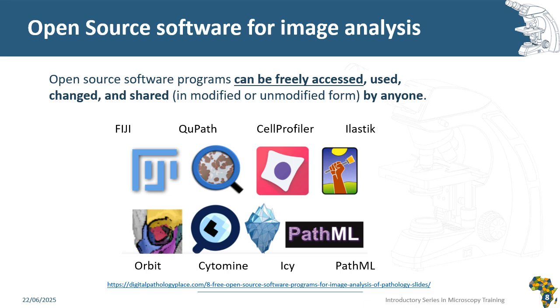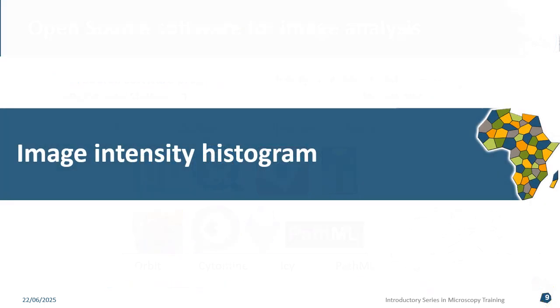lot of data. Some of them are more useful for handling fluorescence and cell culture data. Other ones are more for pathologists and for tissue and patients' samples, and the other ones are more for machine learning and deep learning analysis and implementation.